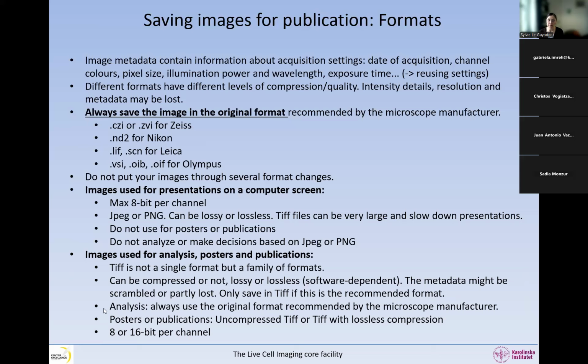And for the analysis, you always use the format recommended by the manufacturer. You never do your analysis on something that you have saved in a different format. And then for posters and publications, you can use either uncompressed TIFF or TIFF with lossless compressions and 16 or 8-bit channels. These two work to make posters and publications.